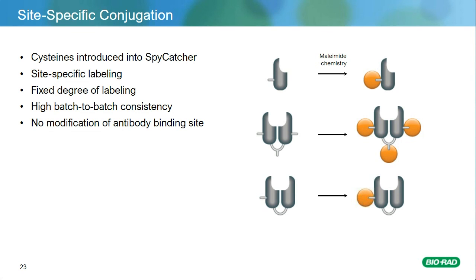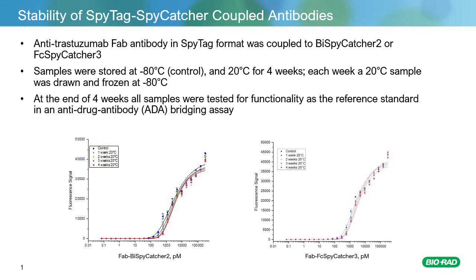So this slide shows essentially a comparison of 3 different formats of the same antibody. So in gold, what you see is essentially the Fab antibody subcloned into a mammalian IgG expression vector. A full IgG is made, and then it's labeled using primary amine coupling. And then the two showing the Fab domains in purple are basically SpyCatcher formats. So the Fab is made as a standalone Fab. It is then protein ligated to pre-labeled catcher domains.